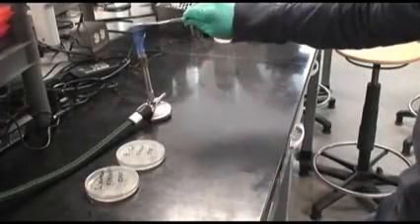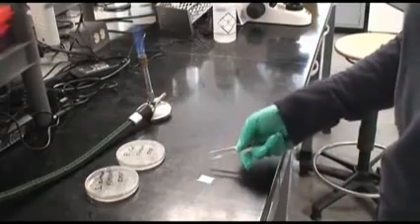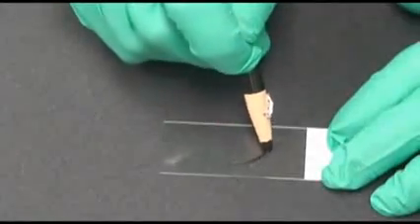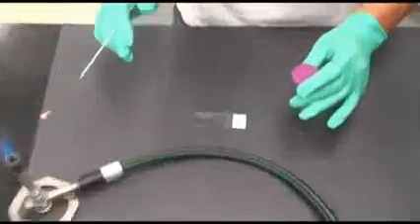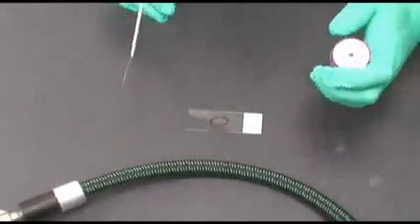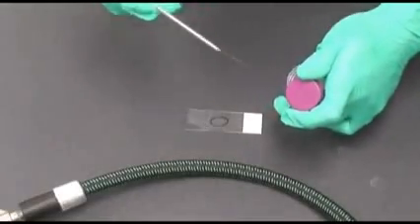First, a clean microscope slide is passed through a flame face down to sterilize. In a similar manner as the simple stain, a small wax circle is drawn on the sterilized slide to identify the location of the bacteria. A drop of water from a sterilized wire inoculating loop is placed inside the wax circle. Water allows the bacteria to be smeared appropriately.